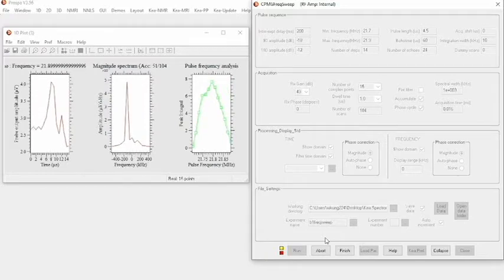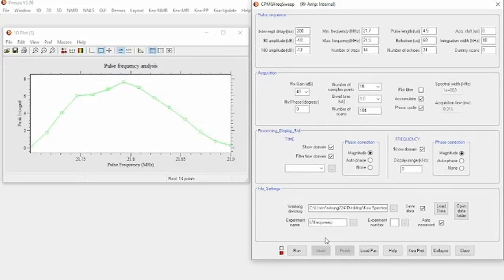It is important to take into account that to determine the correct B1 frequency, we should put run to test if the guessing value is actually accurate. Then, we check the highest value in the pulse frequency analysis. If the value is inside the half fit of the previous graph, we continue to measure the other macros. However, if it is not the case, wobble should be repeated.